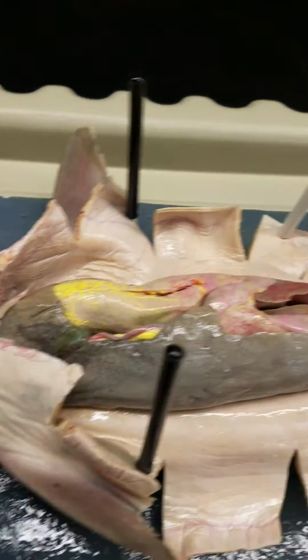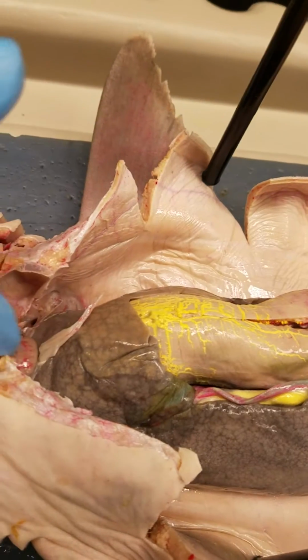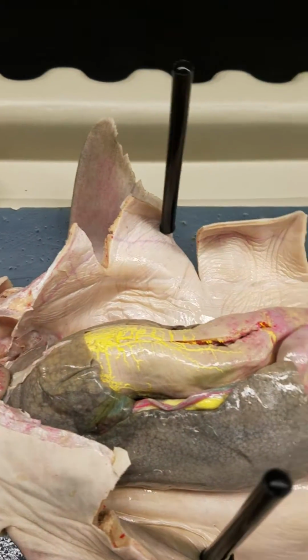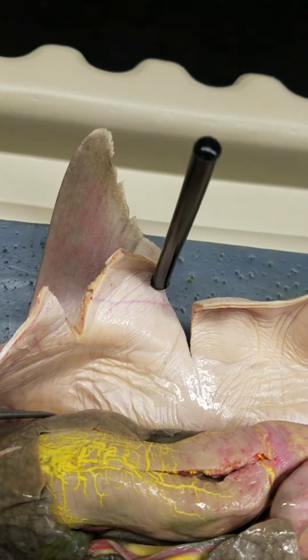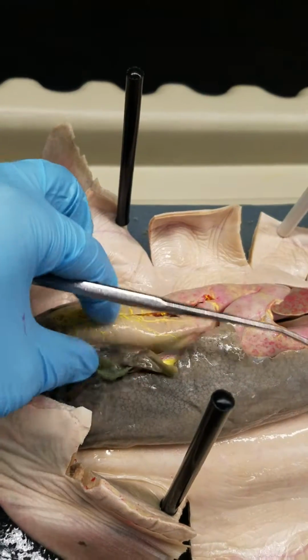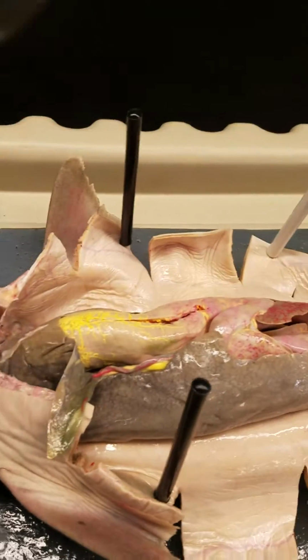Next on to the inside of the shark. Up here you have your falciform ligament. Then you have your liver, your left and right lobe here. Then, because this is a male shark, we have our gallbladder here, which is that little flap.